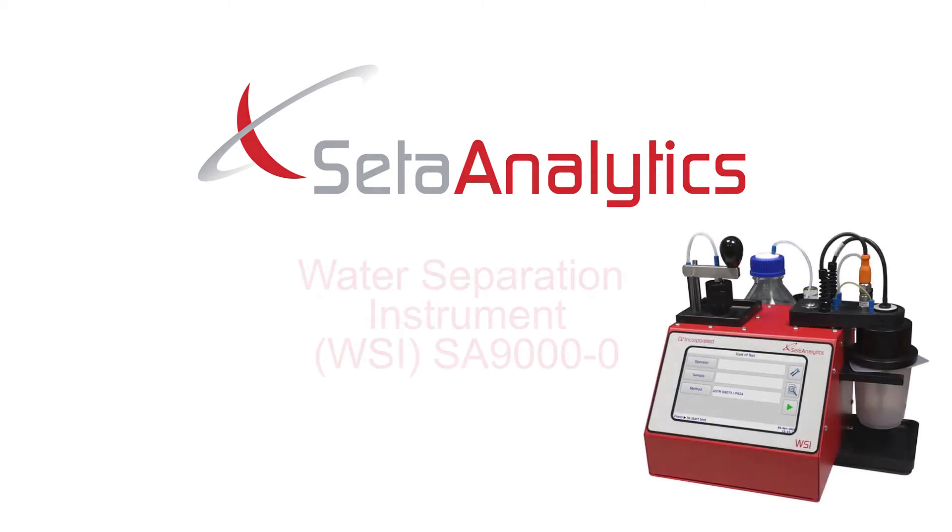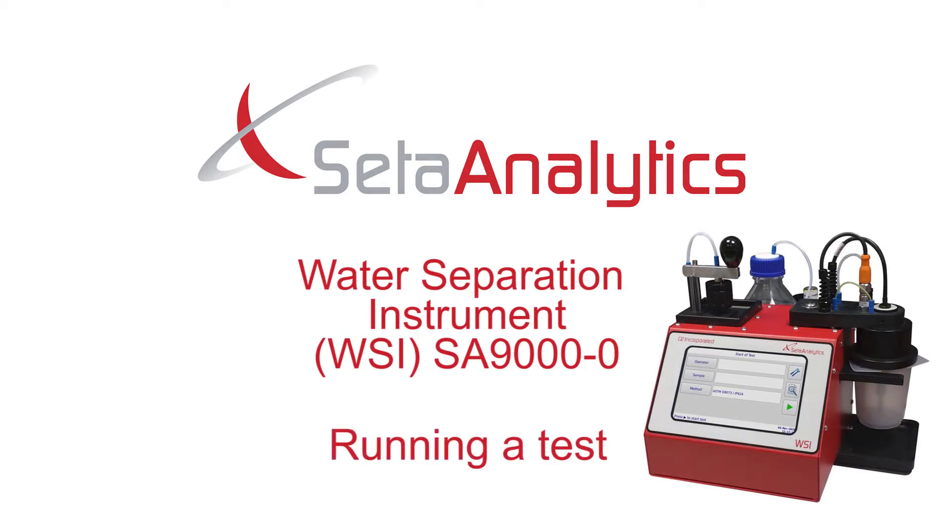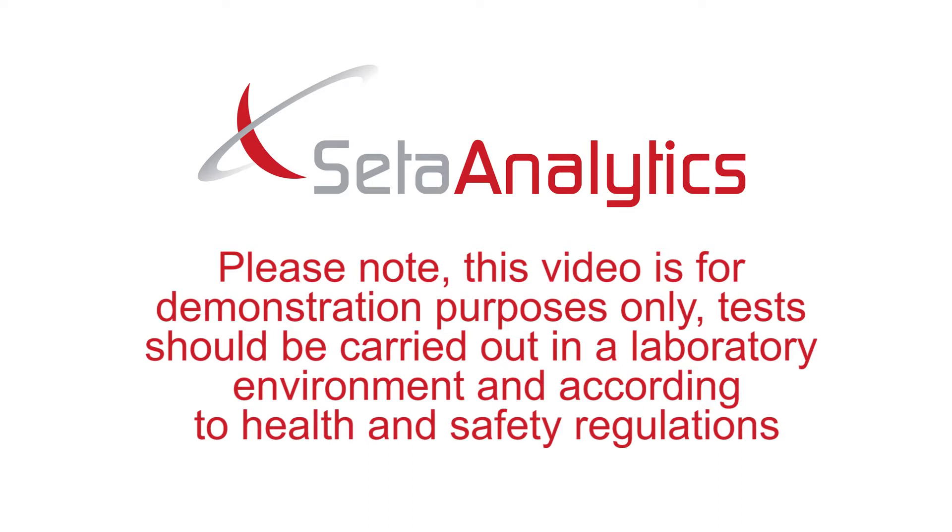In this short video we will be demonstrating how to set up your instrument and run a test. Please note this video is for demonstration purposes only. Tests should be carried out in a laboratory environment and according to health and safety regulations.